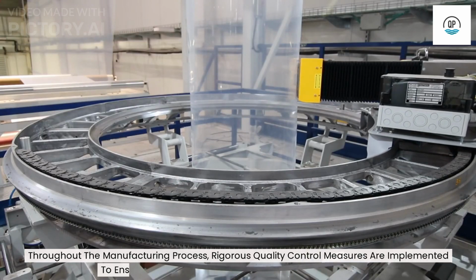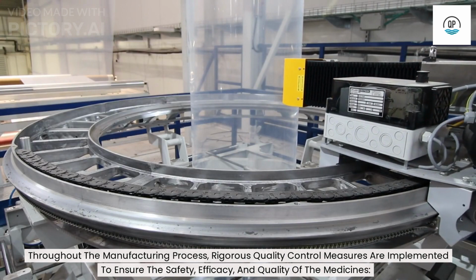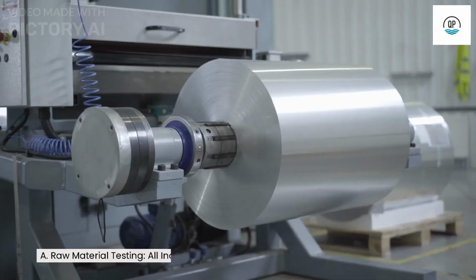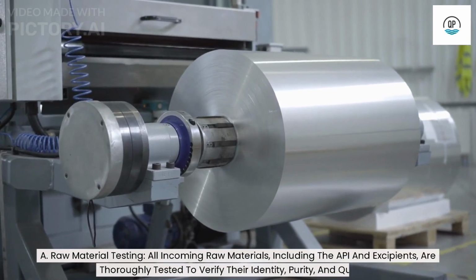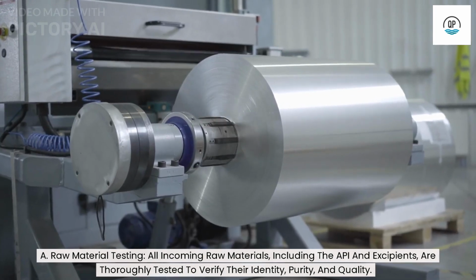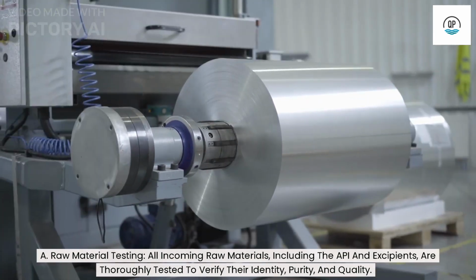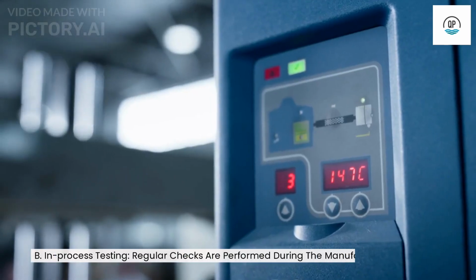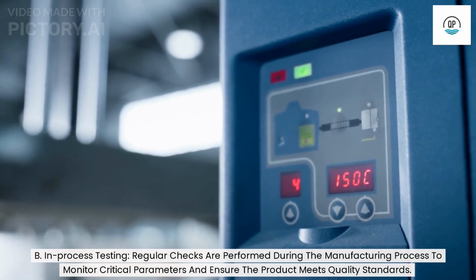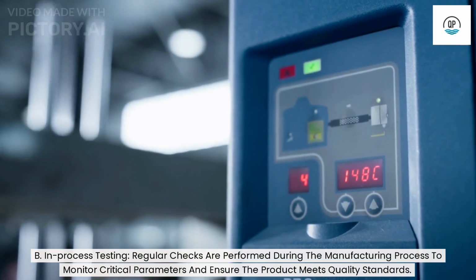Throughout the manufacturing process, rigorous quality control measures are implemented to ensure the safety, efficacy, and quality of the medicines. A. Raw material testing. All incoming raw materials, including the API and excipients, are thoroughly tested to verify their identity, purity, and quality. B. In-process testing. Regular checks are performed during the manufacturing process to monitor critical parameters and ensure the product meets quality standards.